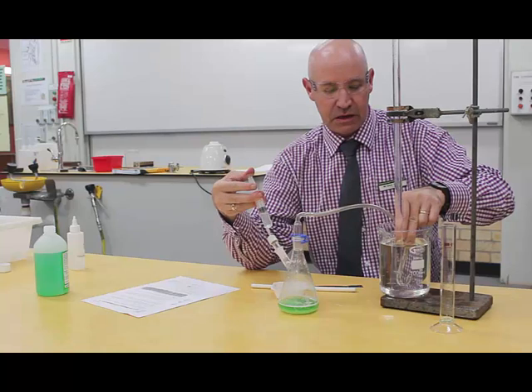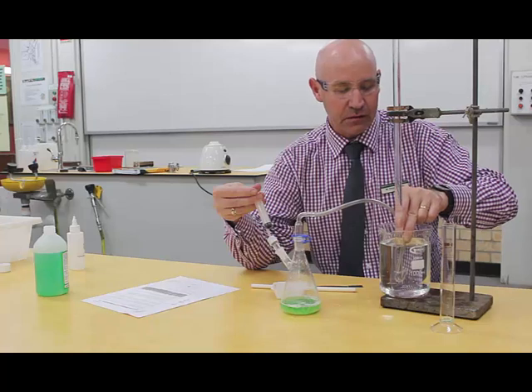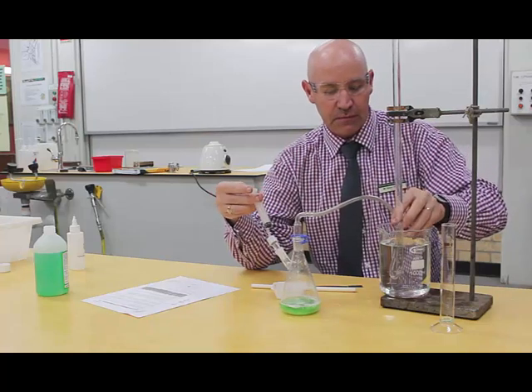You probably see a bubble of air. Can you see the bubble of air go out? Okay, so now I'm going to put it in here.